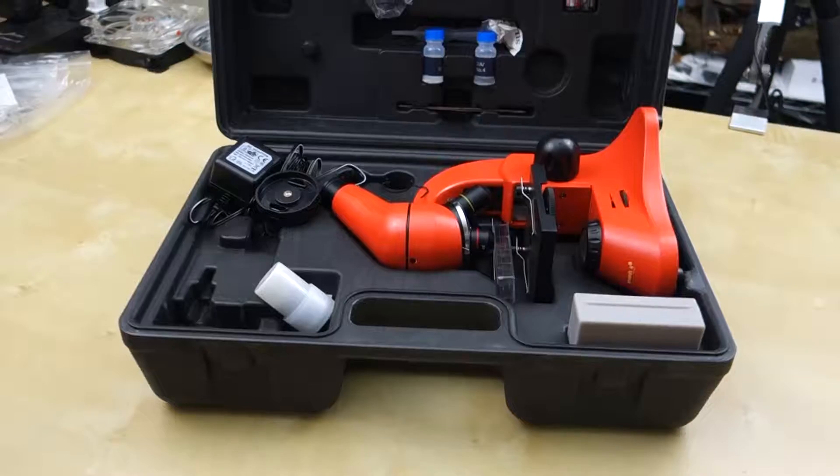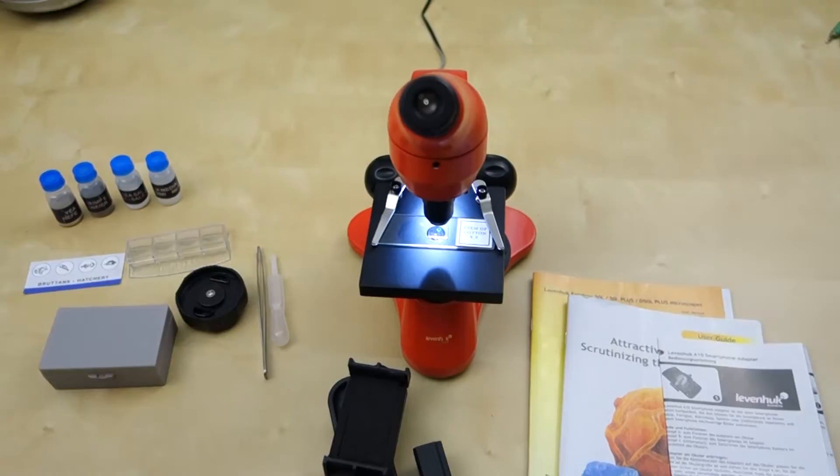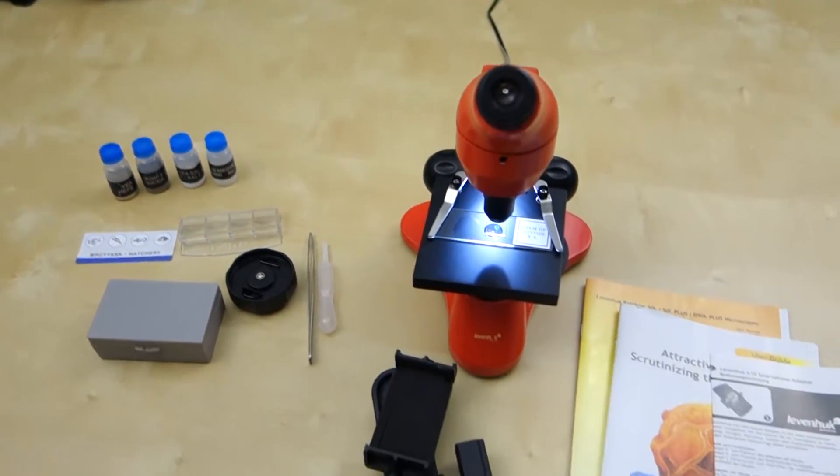So it comes in a nice hard carrying case and inside everything you see is here. So you have the microscope itself, you have power supply for it, which runs over there. I've plugged it in already.